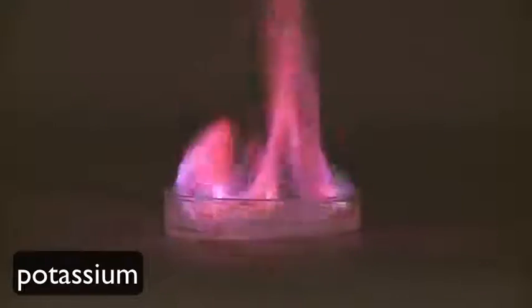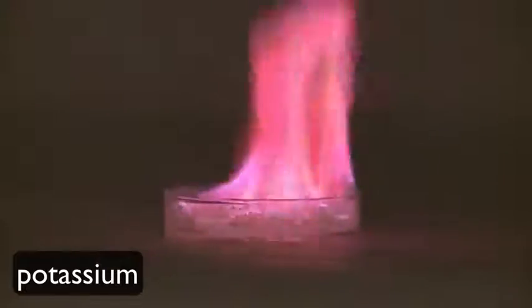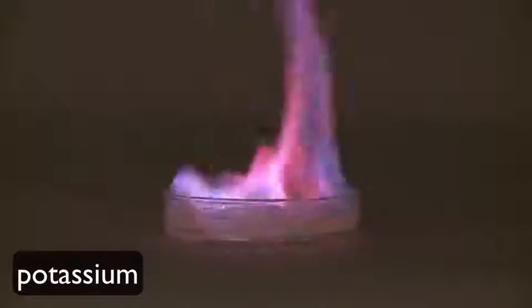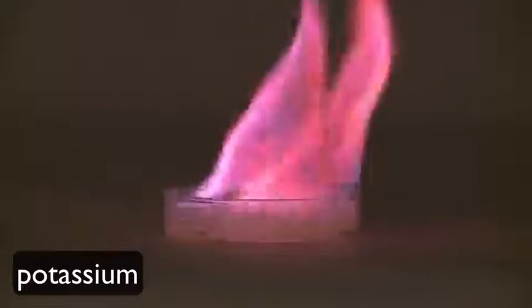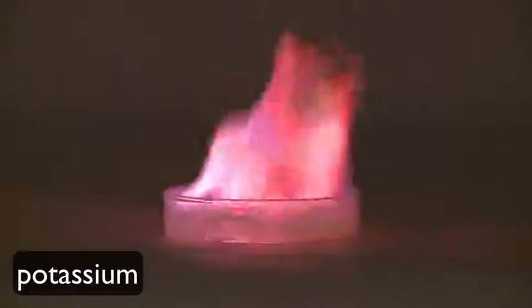Why is each solution burning with different colors? The colors we see emitted as the elements burn are from atomic emission spectra. Remember, the wavelength of those observed colors depends upon the distances between the allowed electron energy levels in the atoms. We are promoting the electrons from the ground state to the excited state using heat in this experiment. Then the atoms emit light as the electrons travel from that excited state back to the ground state, a process that happens spontaneously.